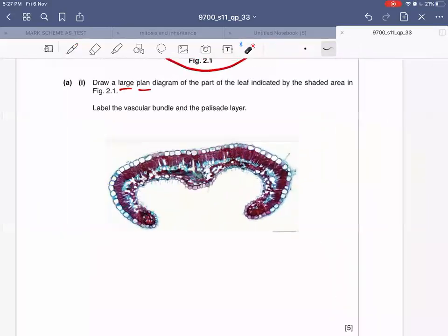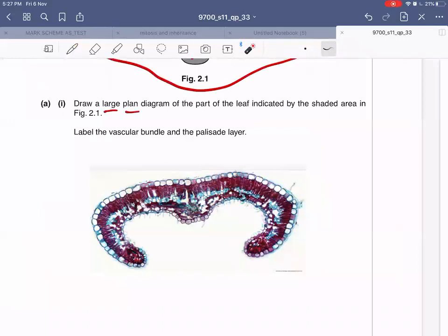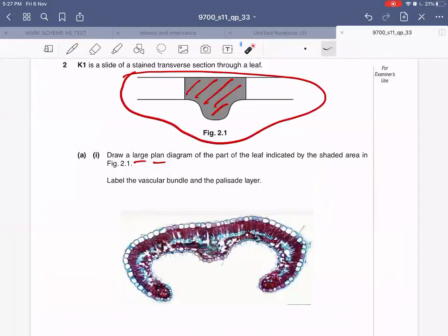Let's try to make a plan diagram of the shaded part only. The shape of your plan diagram should look like this.